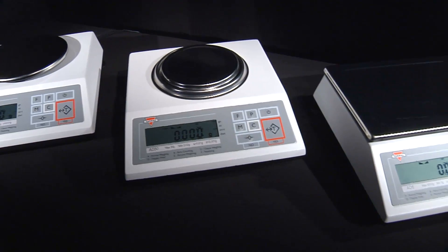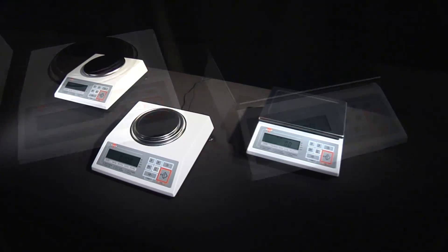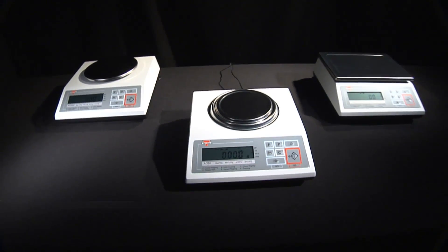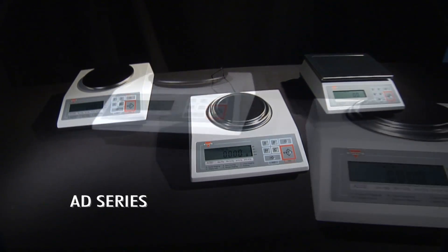Sophisticated on the inside, rugged and simple on the outside, the Torbal AD Precision Series defines the quality of our scales.